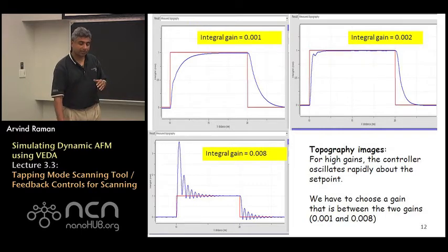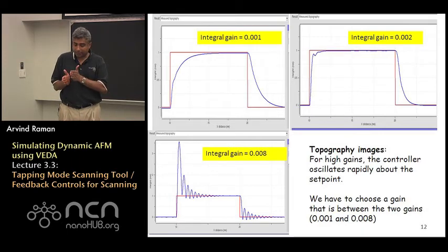And in red is the actual topography of the sample that was entered and the blue is the actual measured topography. And so you can see when your integral gain is very small when you hit the edge of the object for the first time there is a whole region where the controller is going through its transients.